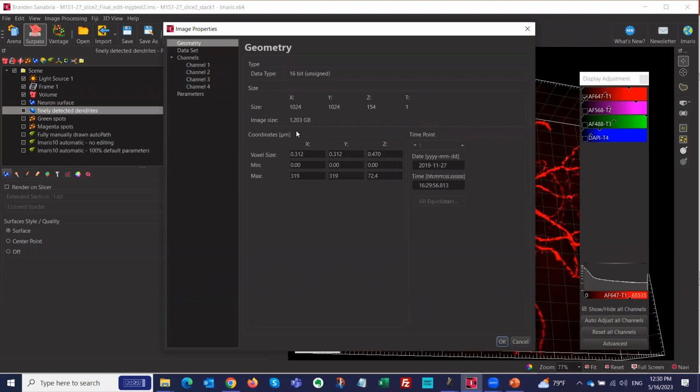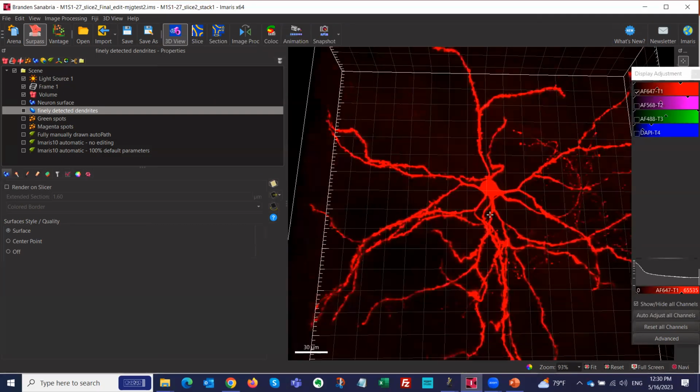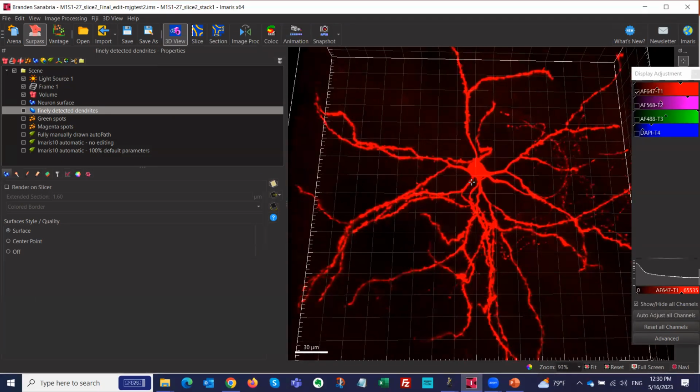Who here, the participants, has used the filament tracer before? Okay, cool, awesome. So I'm definitely going to focus on what we see here, but I'm also going to point out the major differences between what I've done in the past and now. First of all, this is not a demo data set, it's from a user, and it's a nice data set to show exactly what I want to show with Imaris 10. There are other data sets that we can do. At the end, I do want to show vasculature really quick as well, but I want to use this to do the step-by-step process, okay?